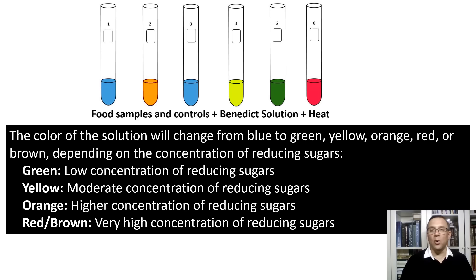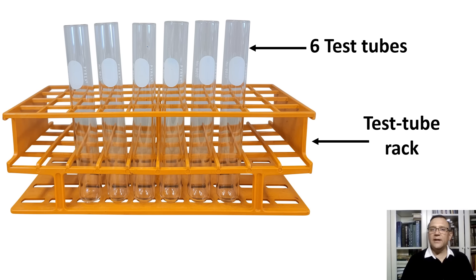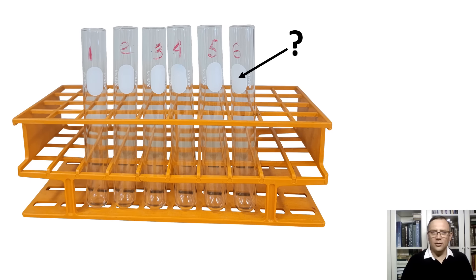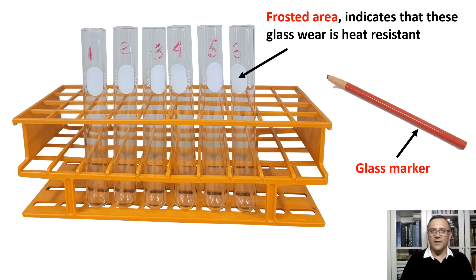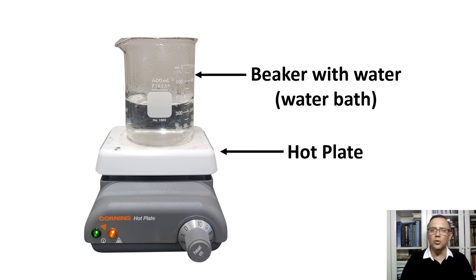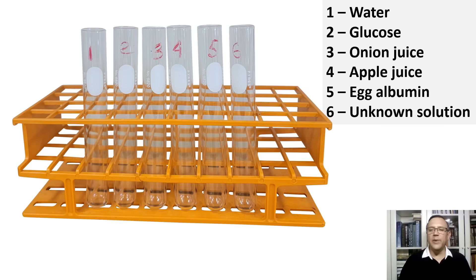Now that we have covered the working principle of this test, let's proceed with the actual experiment. We will obtain a test tube rack and six test tubes. Note that these tubes have special frosted markings — they are heat resistant and not meant for writing on. Using a glass marker, I wrote the numbers of our test tubes above the frosted area, not on it. Before we add the solutions, let's set water to boil in a large beaker on the hot plate at the highest temperature so the water will boil quickly.